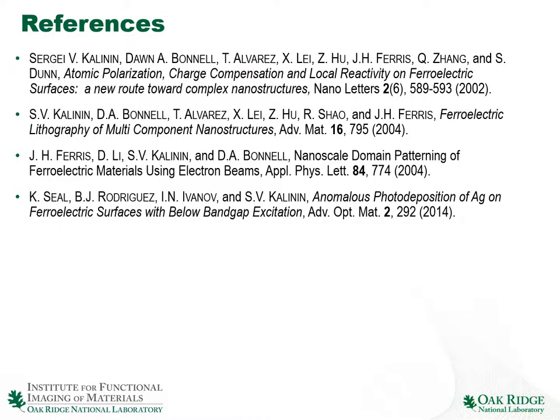You can find the details of these experiments and the discussion of the mechanism of the ferroelectric lithography in the following several publications. So the general introduction of this approach and the discussion of the application of PFM lithography for multi-component nanostructures. And it turns out that we can also use the electron beam, not only the PFM tip, in order to create the domain patterns.